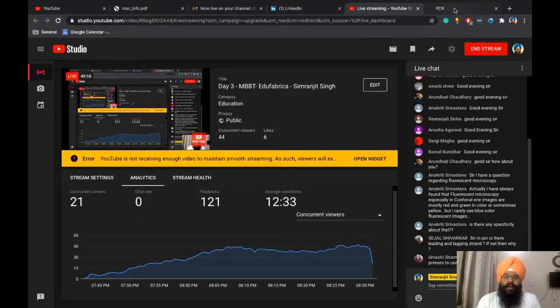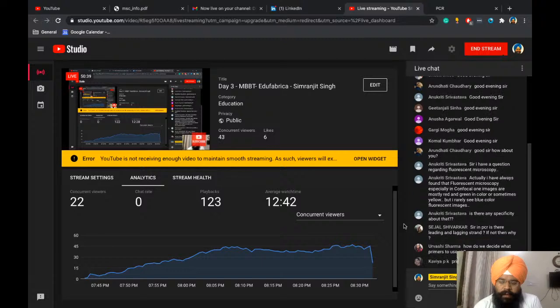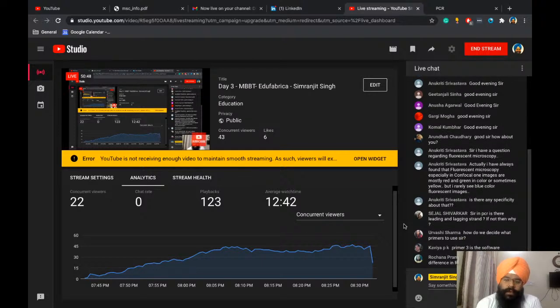So students, for designing the primer, I used to have one software for that. I'm sorry, I lost that software. So we used to have one software which automatically calculates your primers, which primers have to be used for a particular sequence. Say for a particular disease or some cancer gene, we want to check whether that particular sequence is present or not. So you can build that primer with the help of that software, primer 1 and primer 2, using Primer3. Then you can send it to the company, and they will send us back all the primers, and then you can start your reactions with Taq polymerase and nucleotides and with your samples, and then things will be going well.